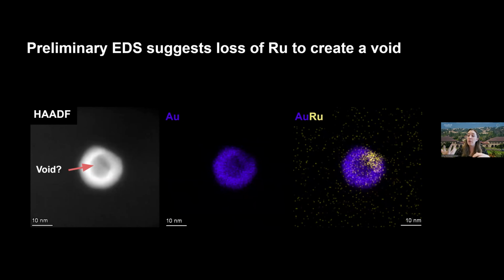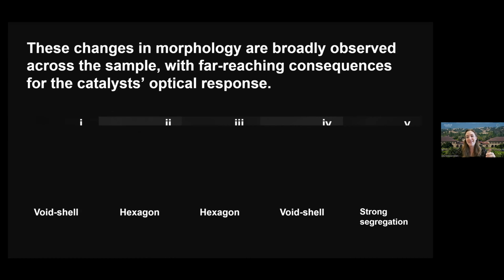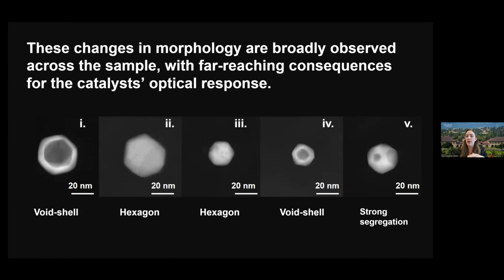And then lastly, we observed this very interesting formation of a pseudo core, which we initially expected would be maybe a ruthenium gold core shell. But again, EDS to the rescue actually informed us that we think it is a void. So either through a Kirkendall diffusion or through a gas-mediated dealloying, the core or a good chunk of this particle is actually being removed in the presence of gas.